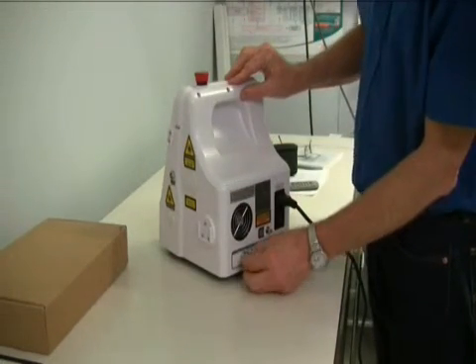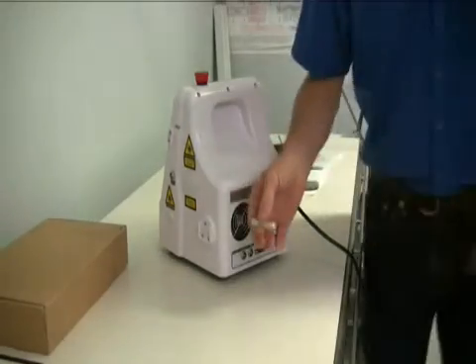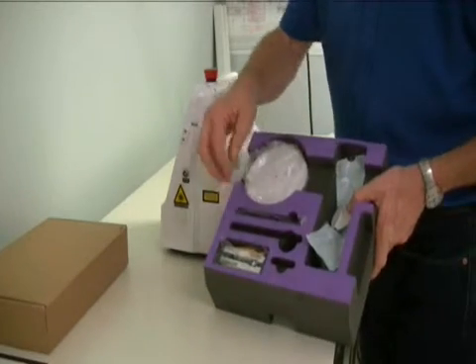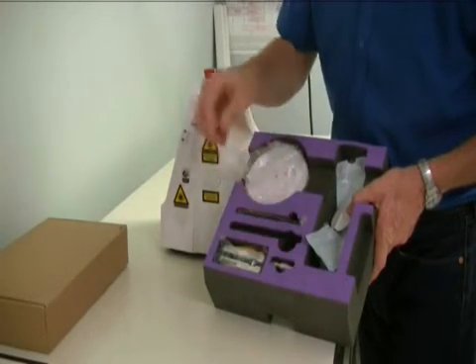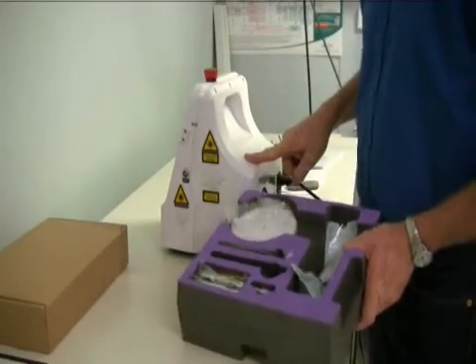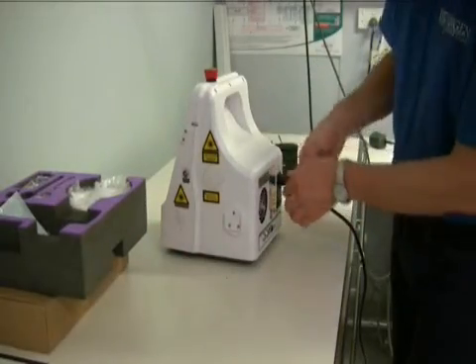Remember the interlock on the back — pull on that and look after it, don't lose it. It sits back in here — that's a safe place, and that's where it stays. It's either in there or it's on the laser. You don't leave it around or you'll lose it and have to replace it.